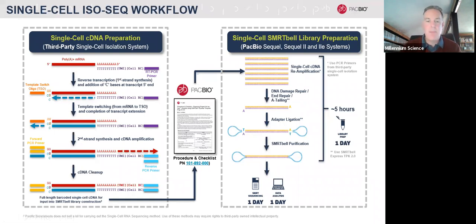And at that point, effectively, you flick it away from a short read sequencing scenario that you might run from the single cell protocol from that sort of provider, whether it's 10x Genomics or others, and flick it into the PacBio protocol. But at that stage, you still have the full-length cell barcoded cDNA. So there again, it goes really into a standard workflow.